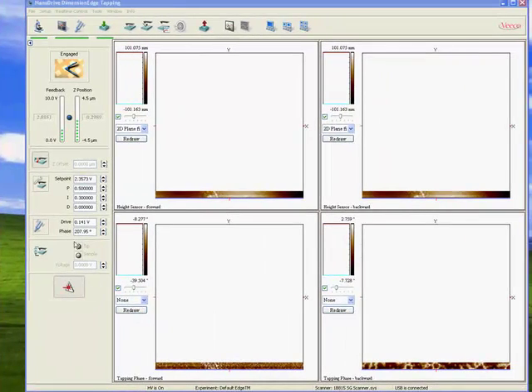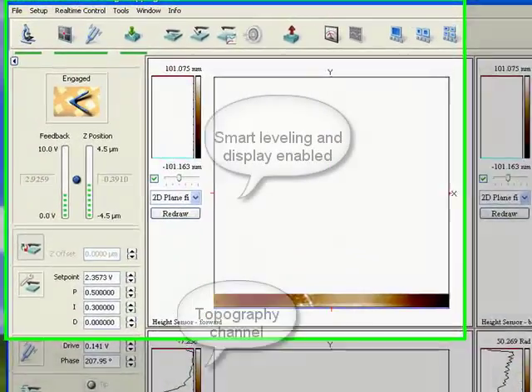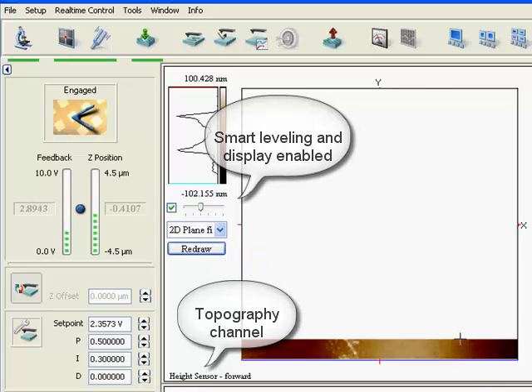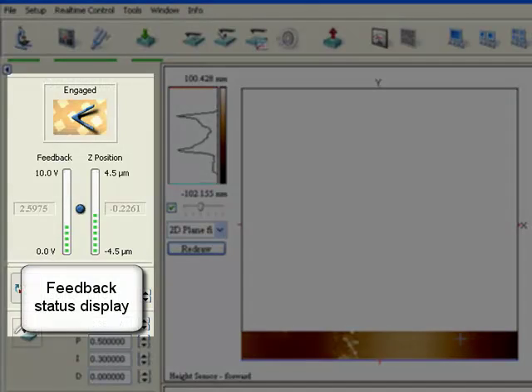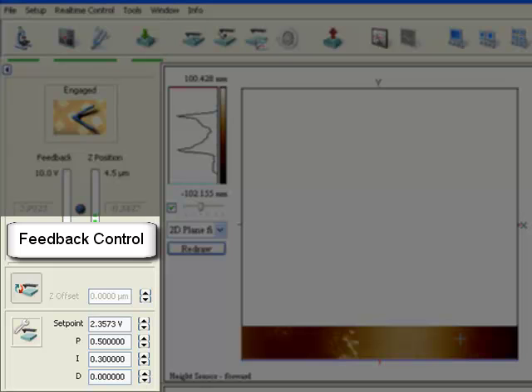Here we see four images. On the top we see the two topography images. We have smart leveling enabled — an automatic real-time plane fit just for data display. Again we see the guided mode on top and everything is green, so we are in perfect working conditions. This is our feedback display indicator, showing the feedback and the position of the Z-Piezo updated in real-time.